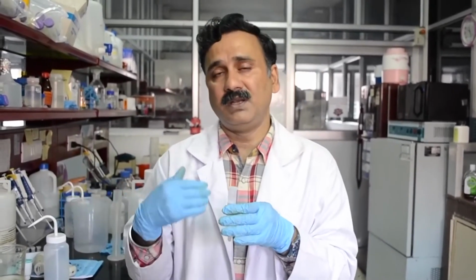That is how it is going to remove the salt from the protein. In case you are interested in keeping your protein in some buffer condition, for example, if it is not very stable in water or non-buffer conditions, then you can equilibrate the column with a particular buffer.